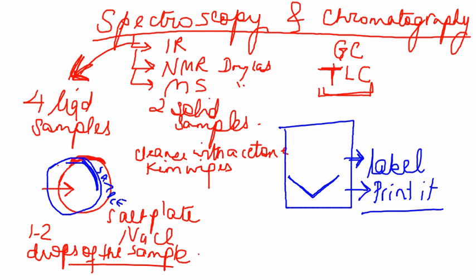And in order to print, you should just right click and hit print, and that prints a good copy. If you go to file and print, it will print out a really small copy, and that usually is of no use. So right click and print, that's what we are going to go with. So really, hitting the buttons scan, label, print, those are the three things you have to do.